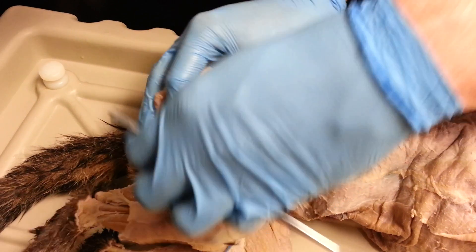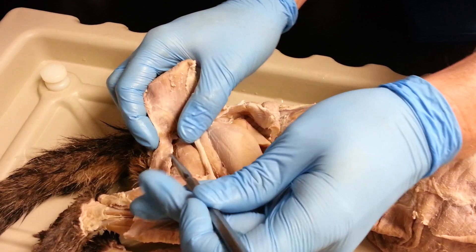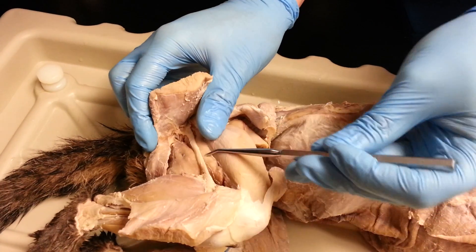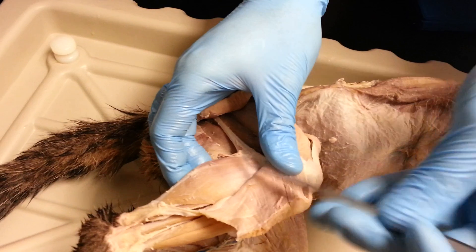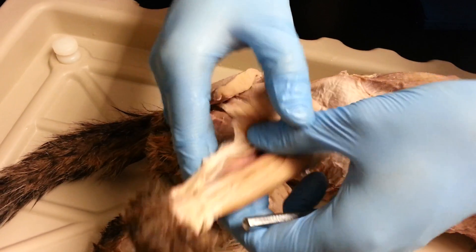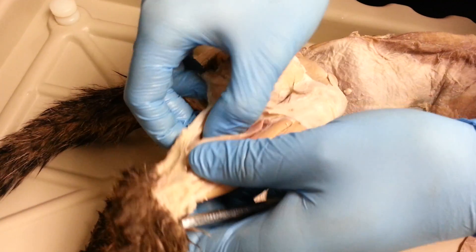Okay, underneath the biceps femoris, we can easily see the semitendinosus, the semimembranosus from the other side, and the sciatic nerve. Then we can also see the gastrocnemius right here. The gastrocnemius is really interesting because it sits on top of two other muscles.